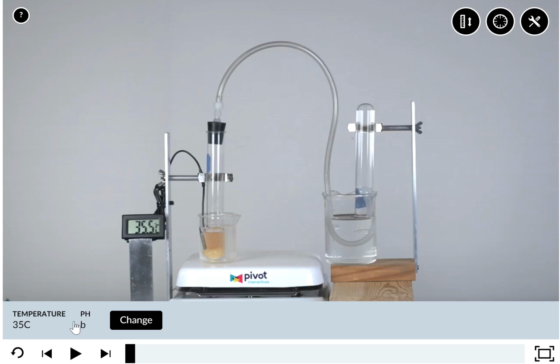All right? So there's also some tools up in the top right hand corner of the Pivot lab that you'll use, and I'll show you how to use those in 1 minute here. Just in terms of the setup of the lab, this is the temperature output. It's a digital output, so you'll know what the temperature of the reaction is. This test tube has catalase in it.